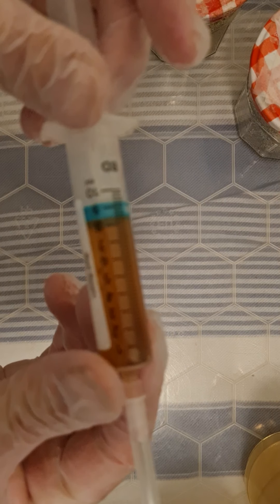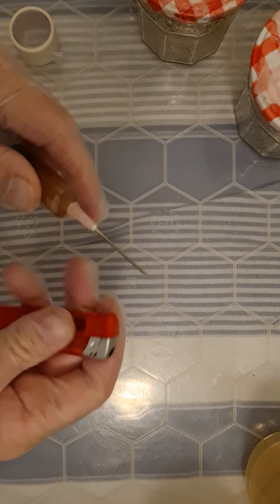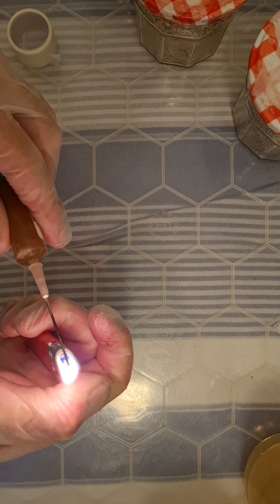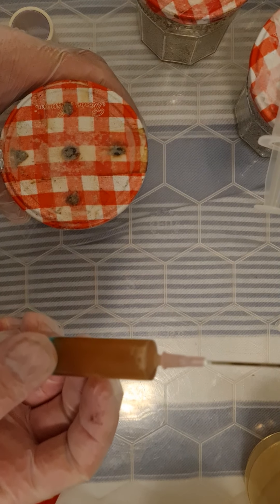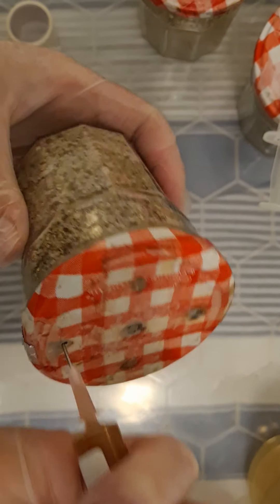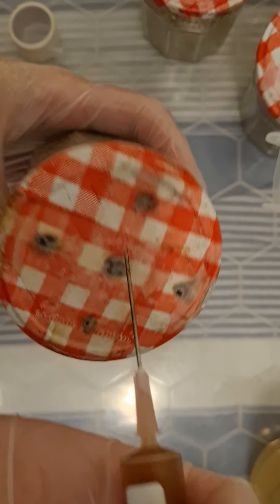This one's a liquid culture syringe, which has got mycelium in liquid. That mycelium has already been grown out and selected to be a specific strain. Just do the same again — you only want less than a mil in each hole.